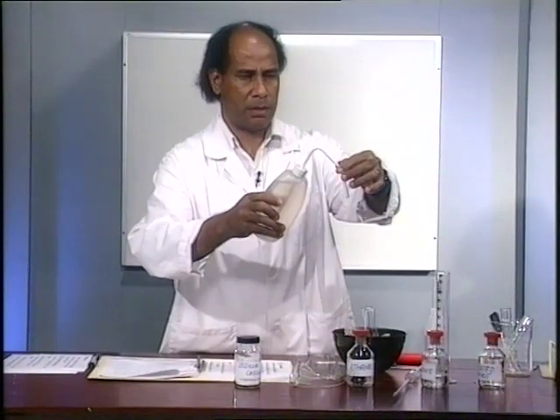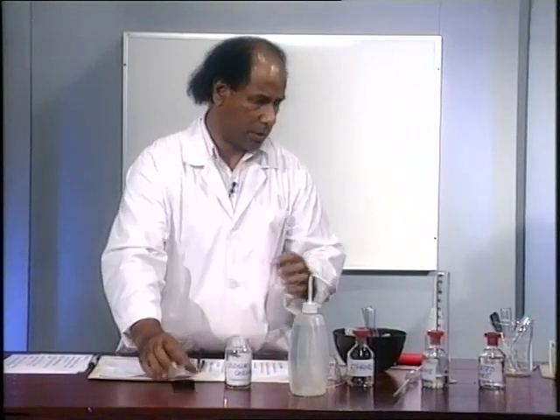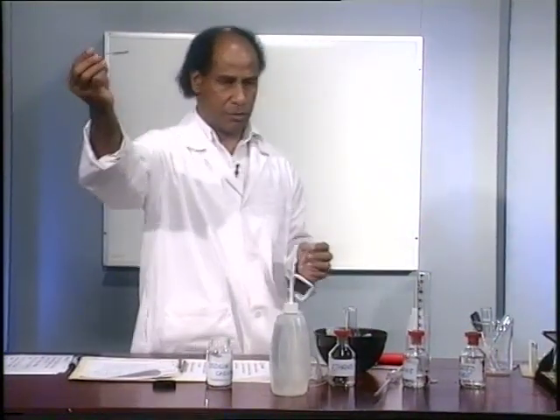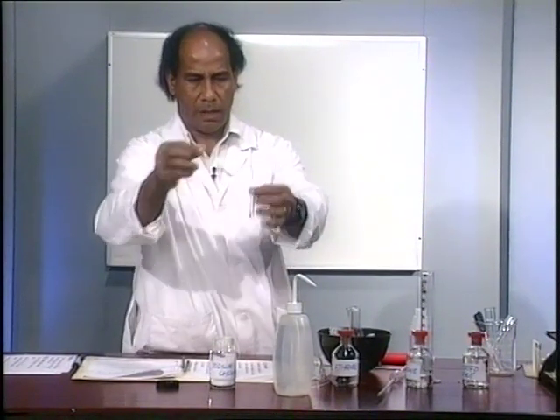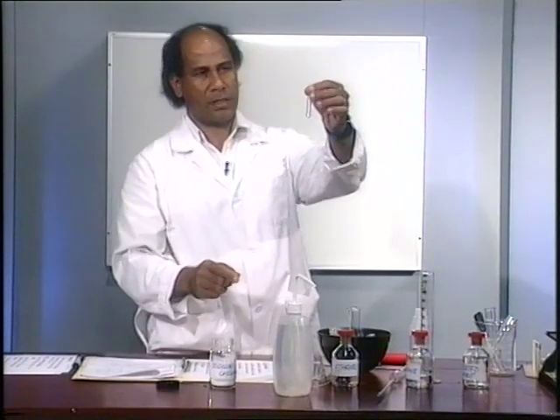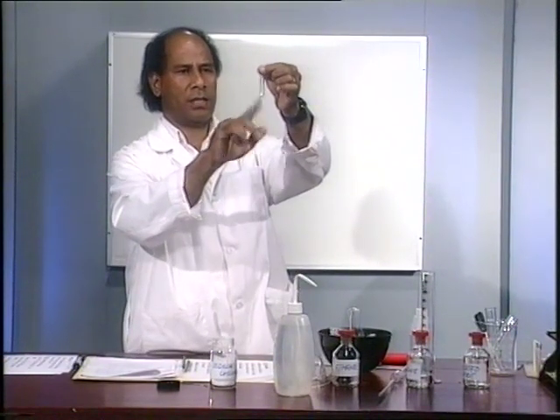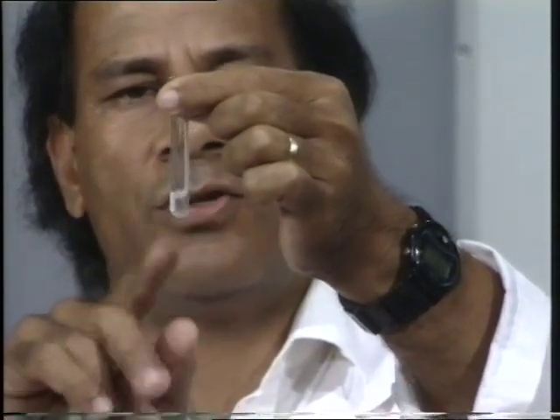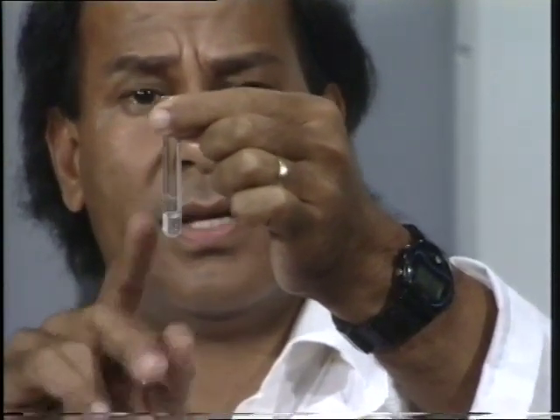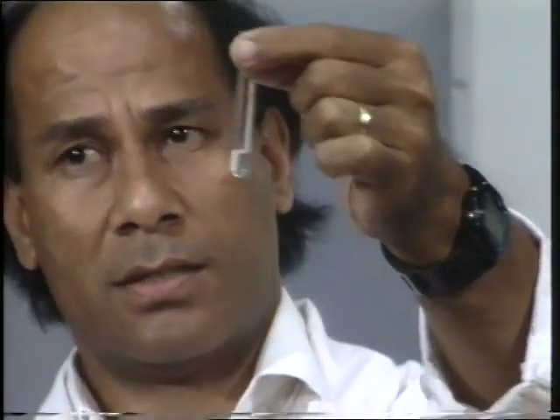Okay, this is your first solvent, water. So we add a small amount of that. And to add your salt, if you have a micro spatula, use that, that amount there. Just add it into there. And the way to do it is you don't put your thumb here and shake it. We discourage that. Okay, you shake it this way. That's the proper way to shake it. And then you should be able to see whether it dissolves or it doesn't. Right? So in this case, sodium chloride, we can see is quite soluble.